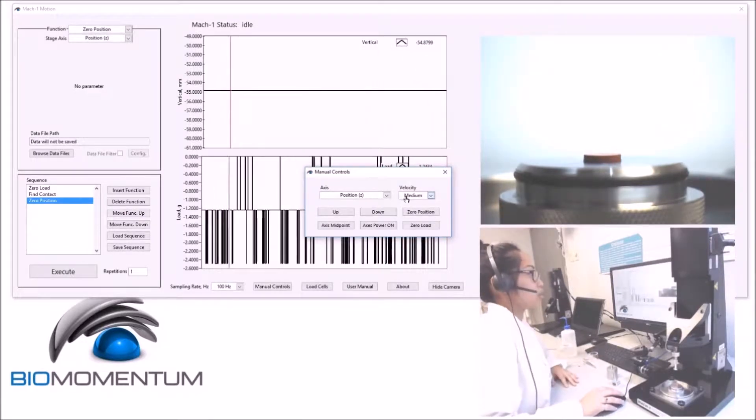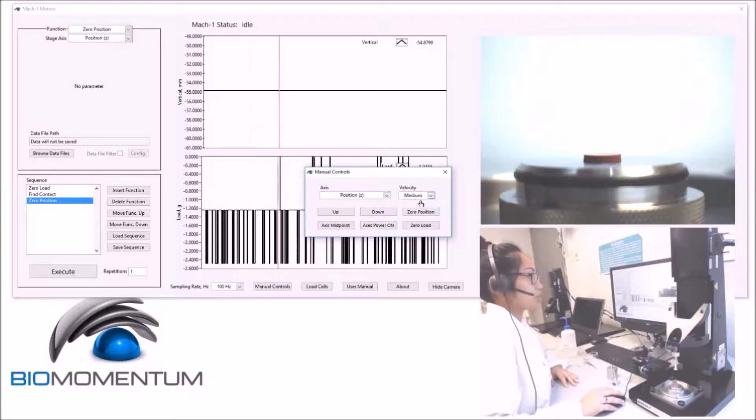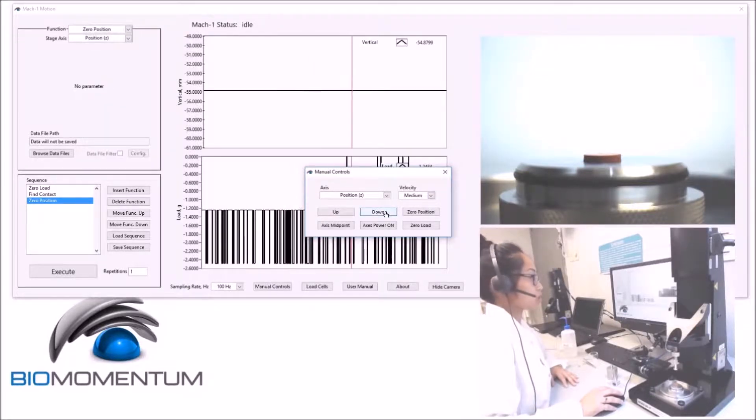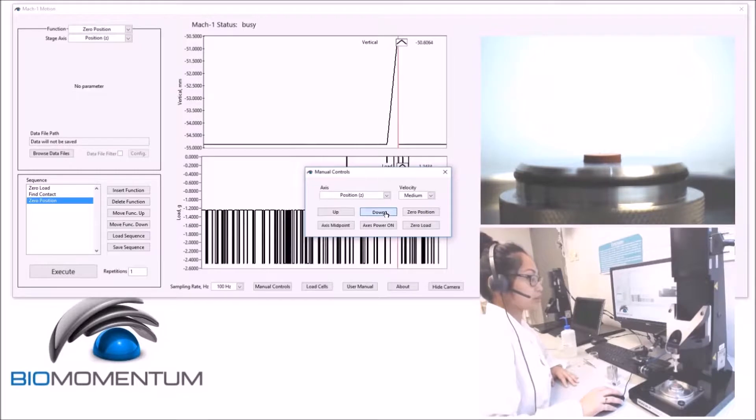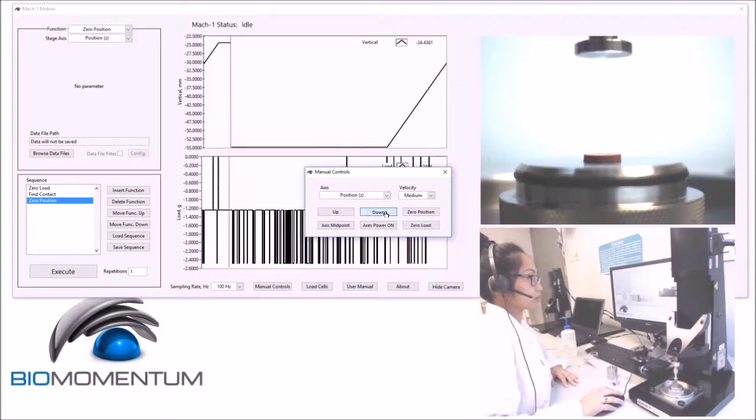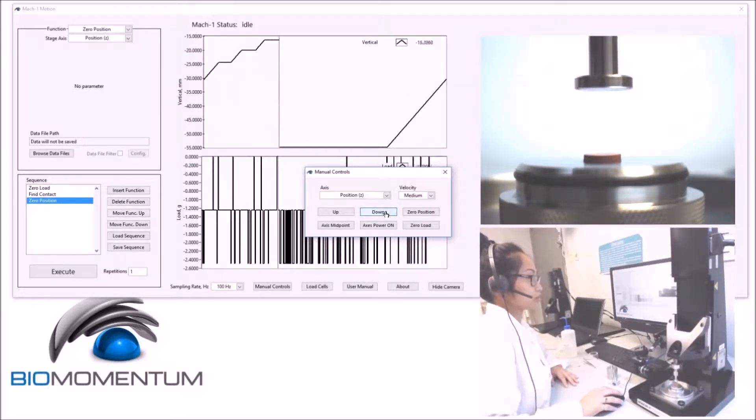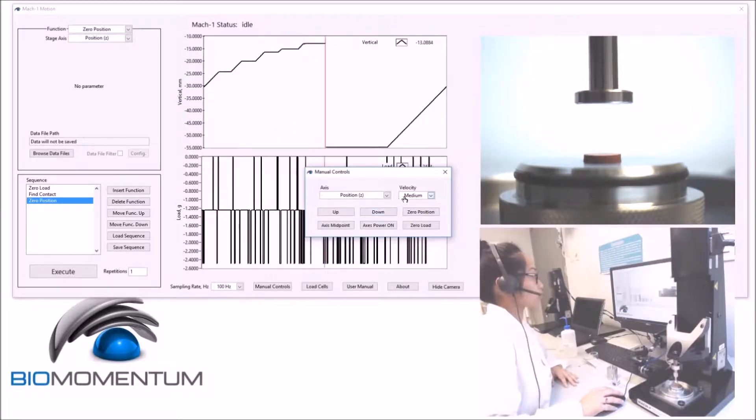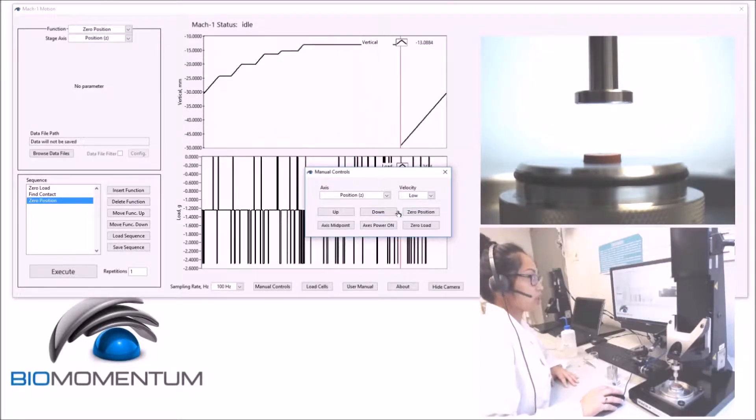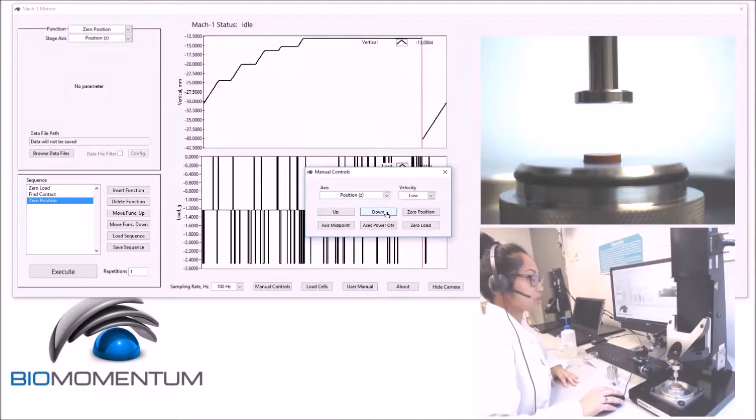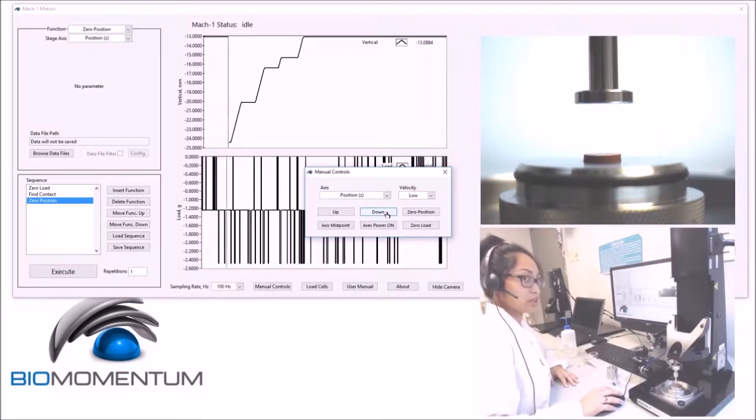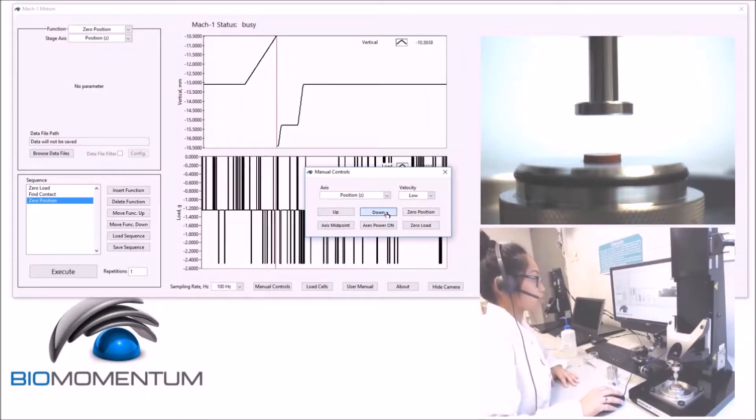Lower the stage using medium speed to approximately 20mm above the sample. And using lower speed, lower the stage to approximately 2mm above the sample holder.